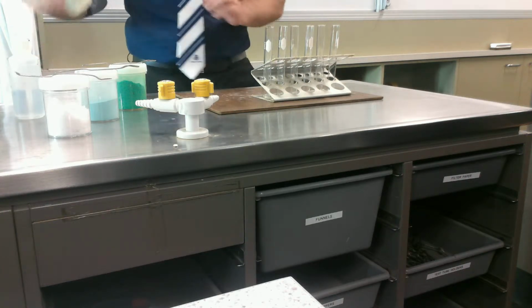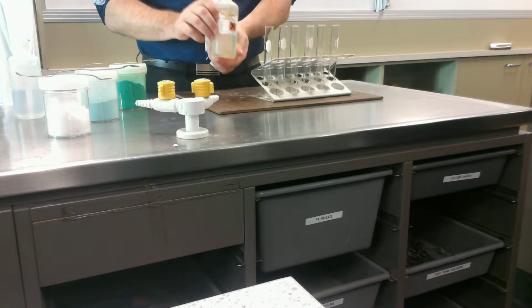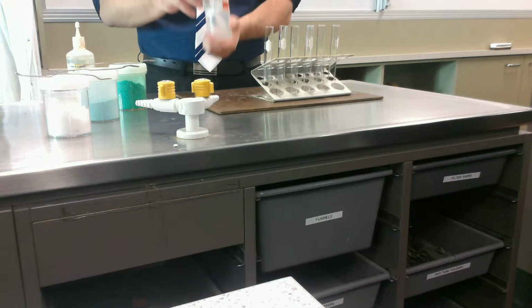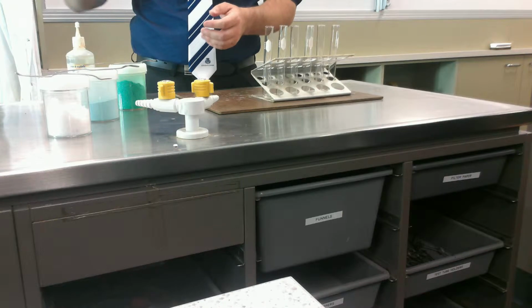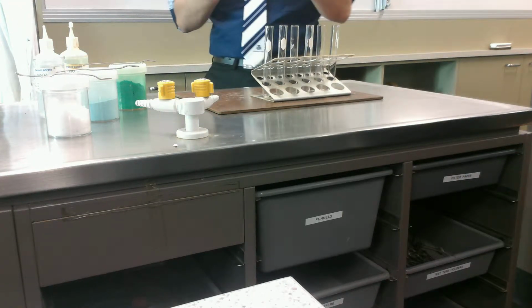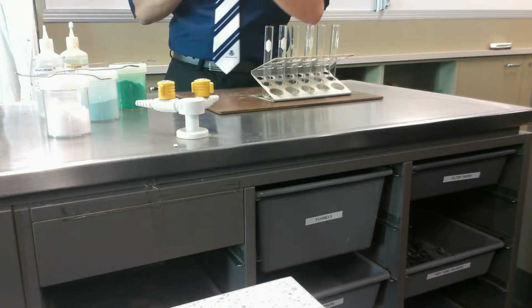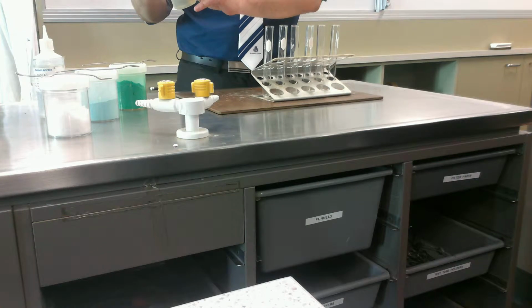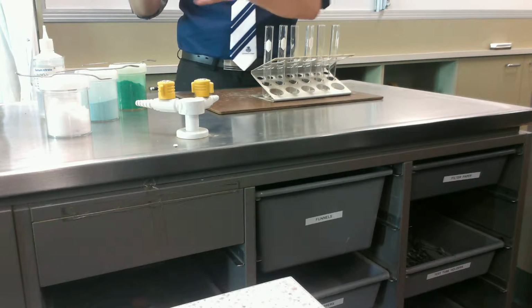So what I've got here is a solution of iron sulfate. So what does that actually mean? I've also got a solution here called barium nitrate. What does that mean? Well, what it means is that I've got a solid of those things. They're called ionic compounds. You don't need to remember that. But I've got some iron sulfate and I've put it in water and it's made a solution.